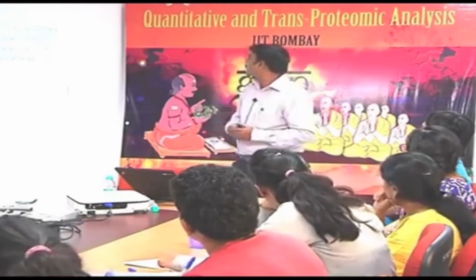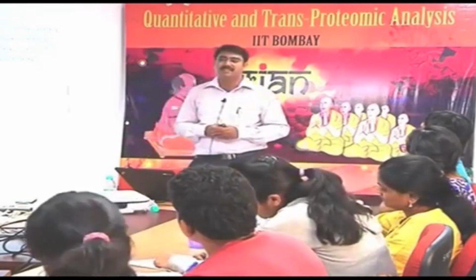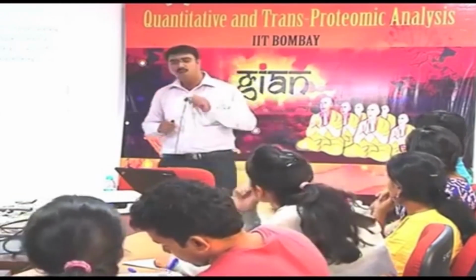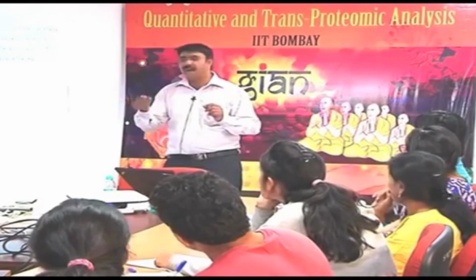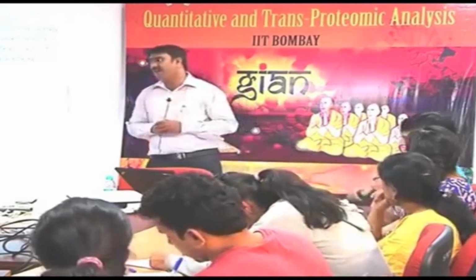Here I am going to discuss the solution solid interface. What exactly is the solution solid interface? Suppose two proteins are interacting together, one protein has to be put on a solid support and the other should be in solution form. That is what we call a solution solid interface.